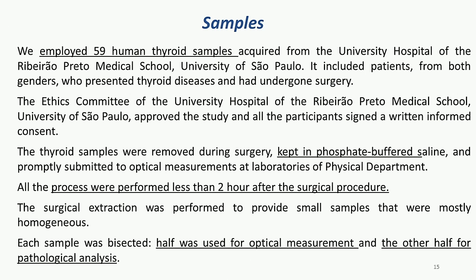And the surgeon separated for us a very small piece of tumor, very homogeneous, and half of this part was sent to the pathology analysis and the other part to us to make the fluorescence measurements.